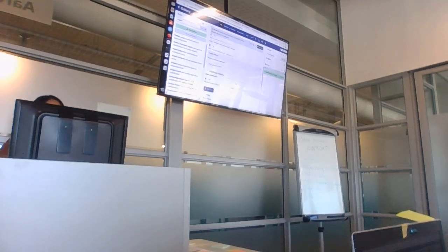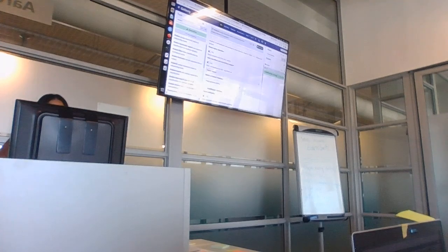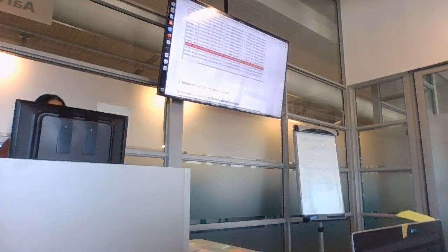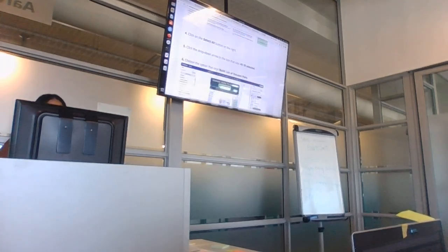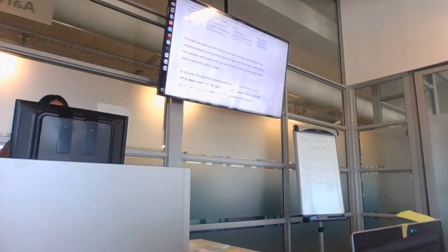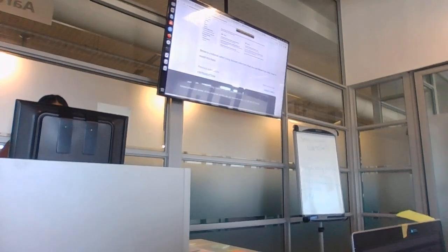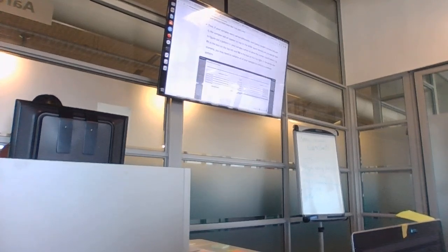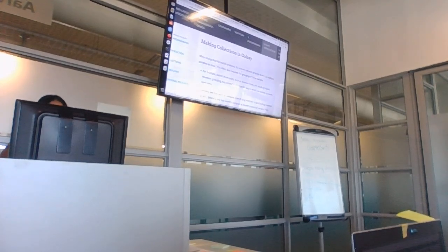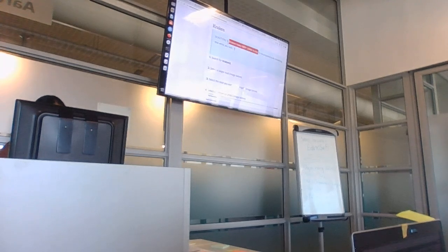The only thing is we're not going to do it because it will only save if you run the tool. And we're not going to run this tool, but I did put the instructions in there if you want it. We don't all want to submit this now to the Galaxy server and freeze it up and then we can't do the next step. Because like I said, there's a hackathon happening as well. But I did put instructions in the last one, workflows. There should be instructions here for running Kraken, and I did say it takes very long.